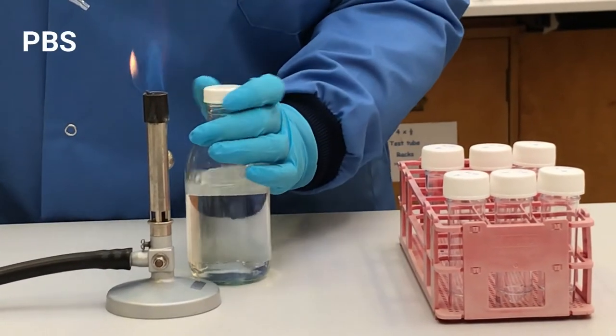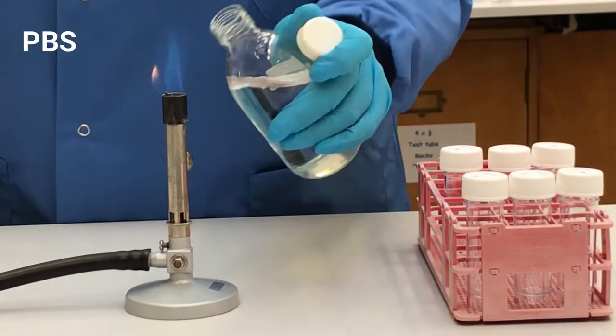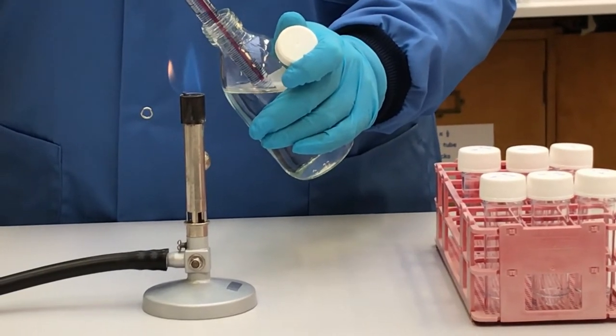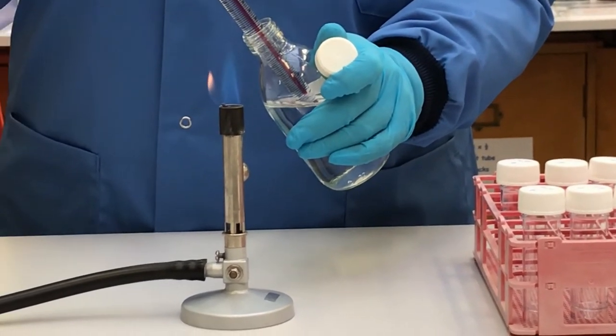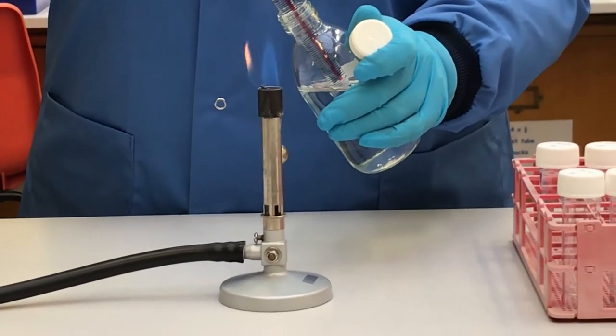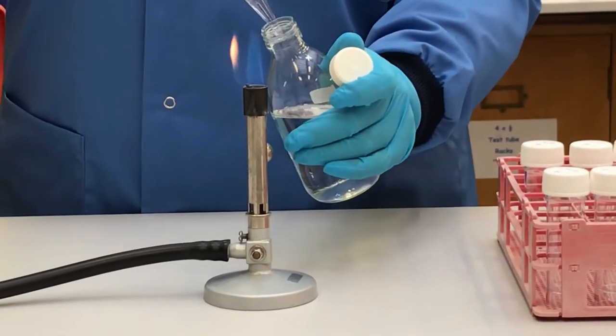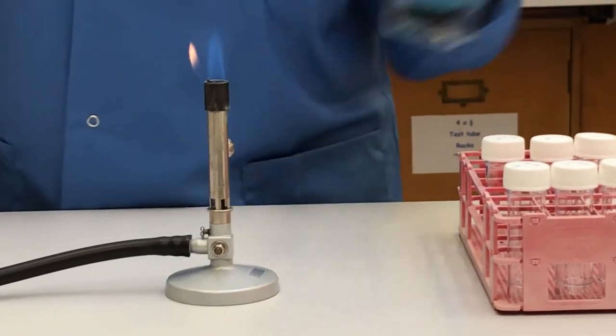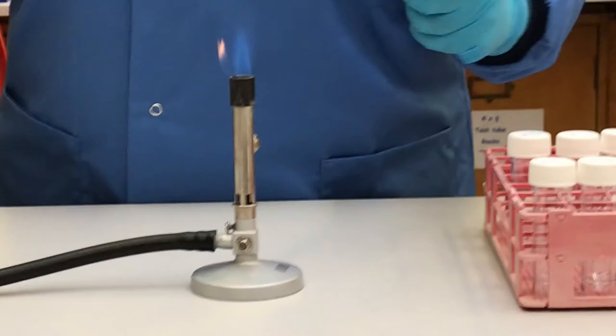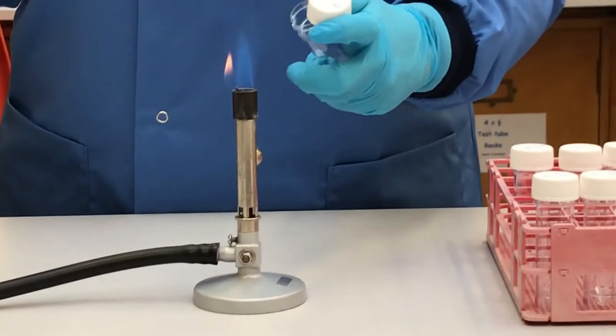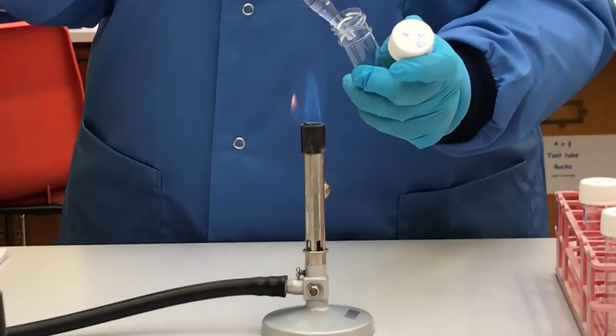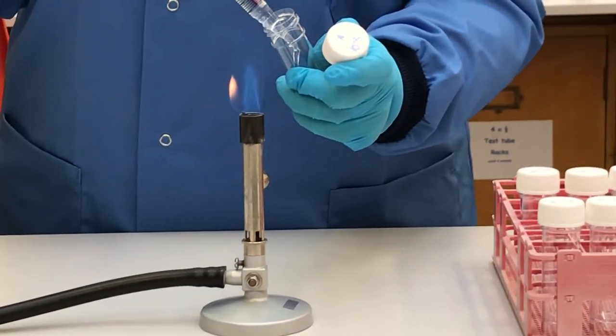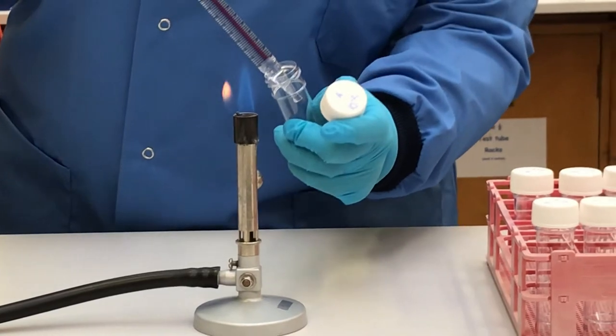Next, you will perform three serial tenfold dilutions for Sample A. To do this, add 9 ml of PBS to three universals. These should be labeled 10 to the minus 2, 10 to the minus 3, and 10 to the minus 4. Remember to use aseptic technique throughout.